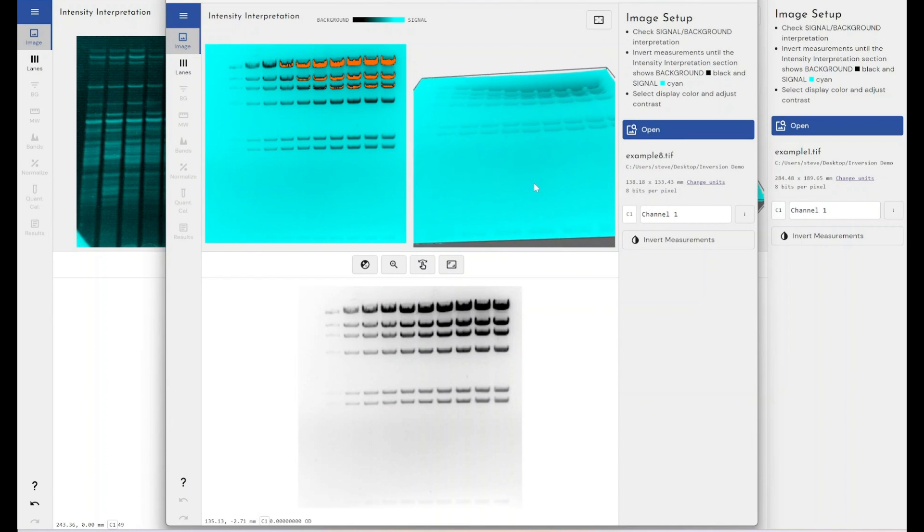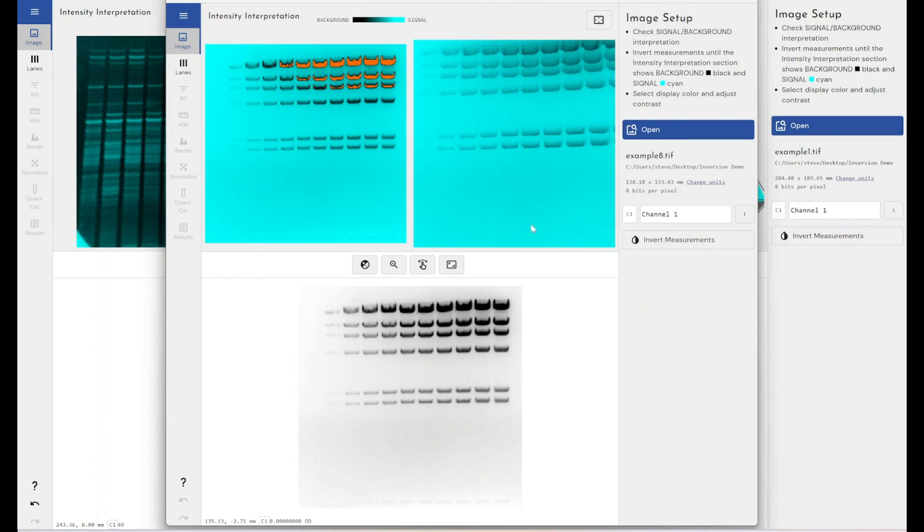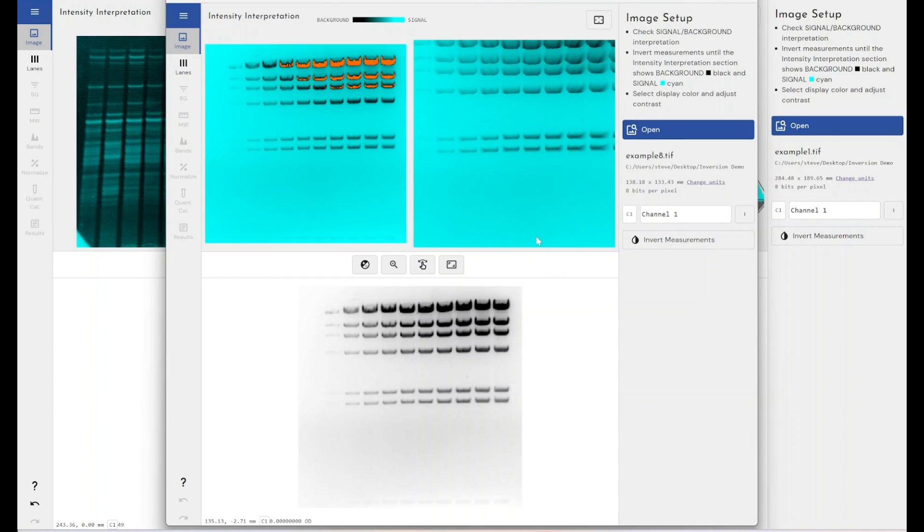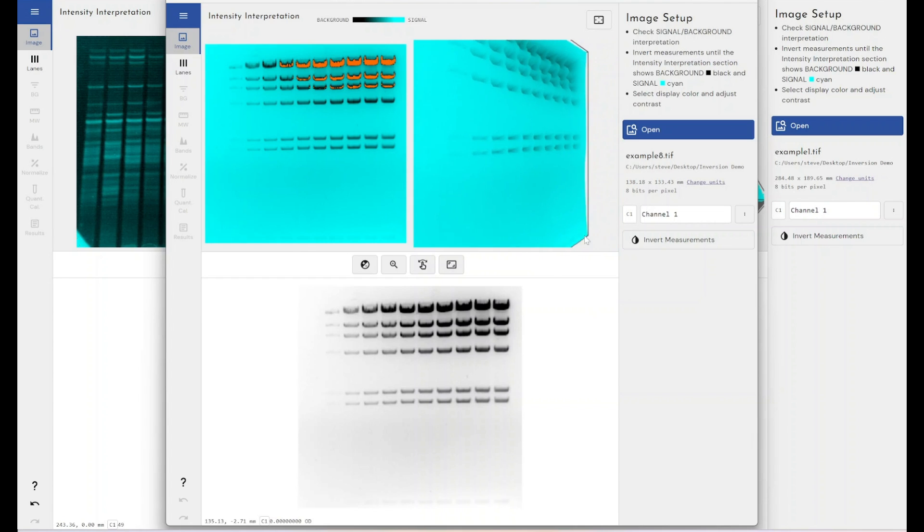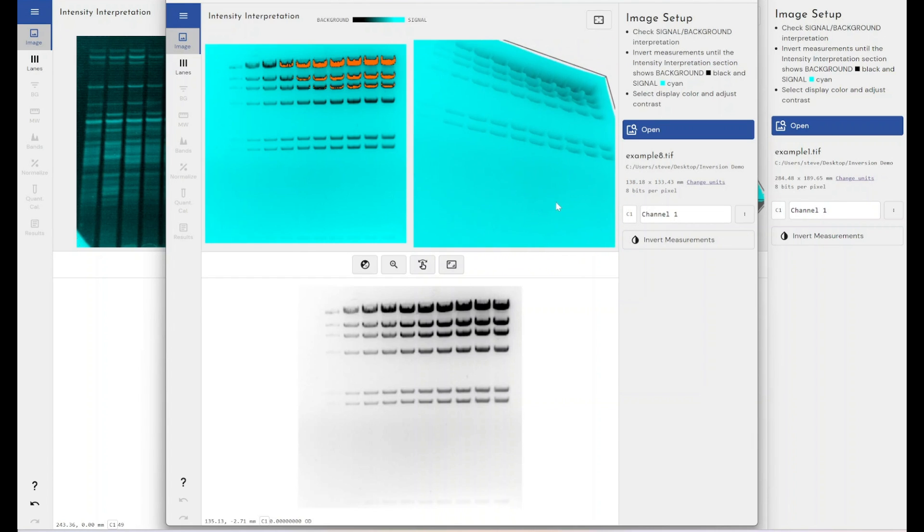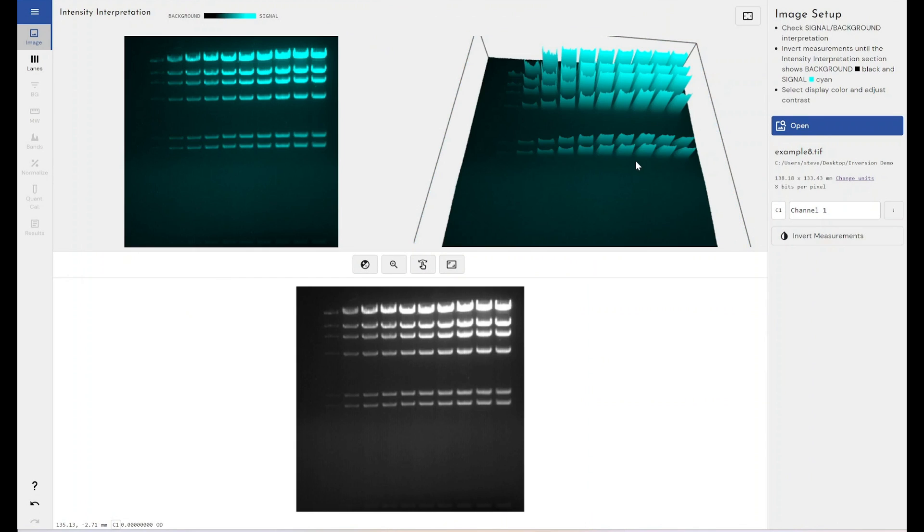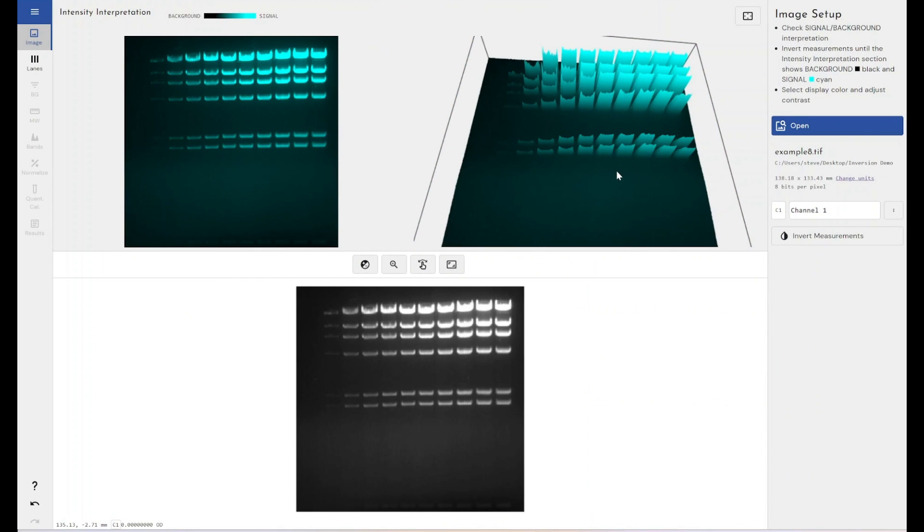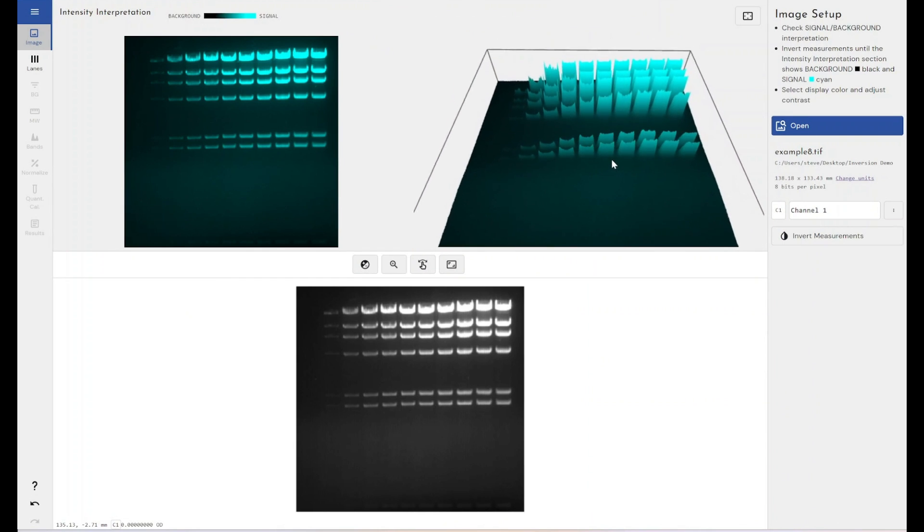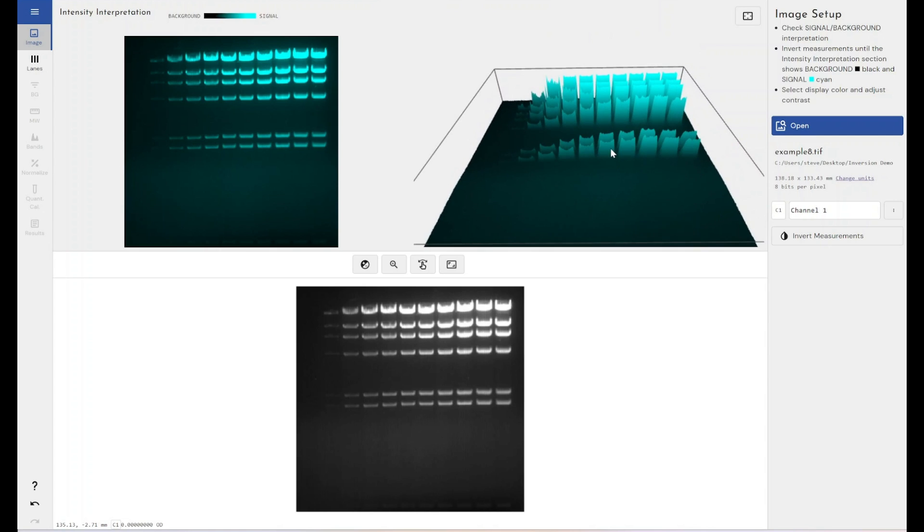However, if you look again at the 3D view, you can see that we've got troughs where our signal is instead of peaks. So that tells you that you need to invert the measurements. When you invert the measurements, well in fact actually, in this case, when you invert the measurements, you do get the white bands on the black background again.